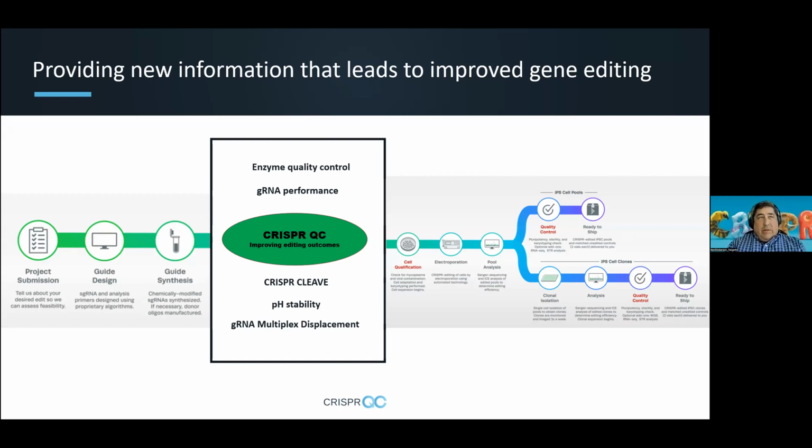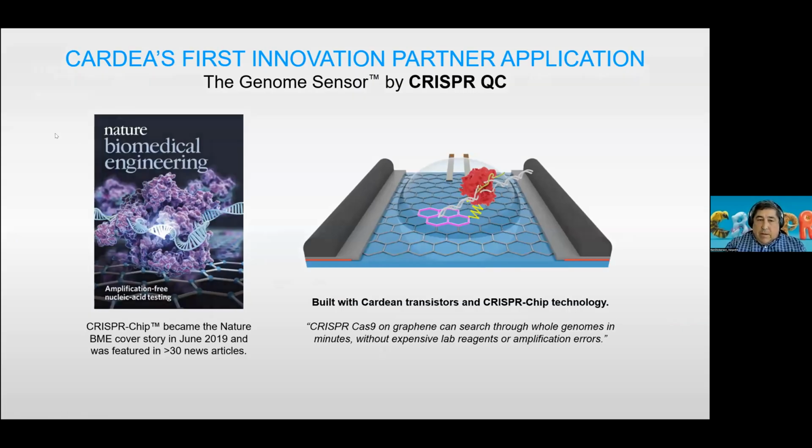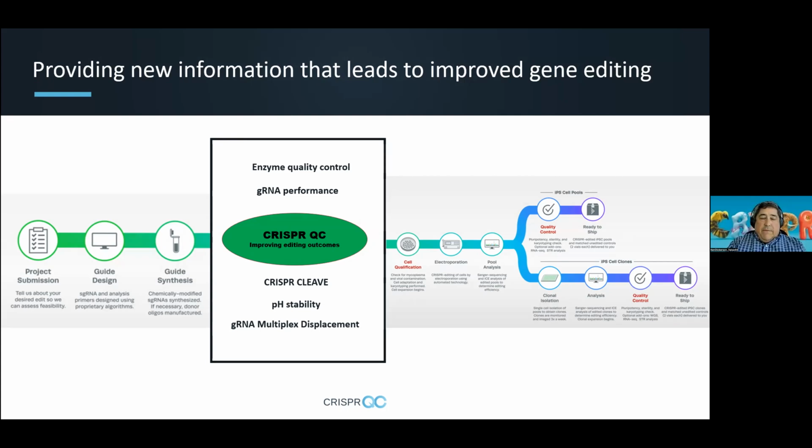And it really has a breakpoint, I see, where you would typically focus on an in silico portion. So as Francie mentioned earlier, when she briefly stopped on the CRISPR area, she talked about guide RNAs. Well, guide RNAs are essential in the process of developing a final goal of editing a cell line. And they are designed by inputting sequences or loci information into in silico software. And what that does is it kicks out several different recommendations of guide RNAs that could be used for this editing event in cells.